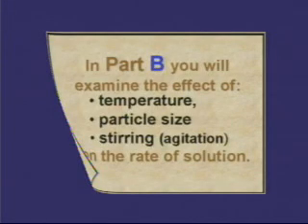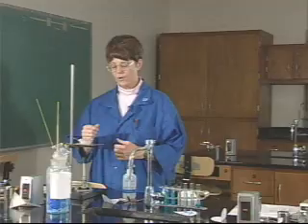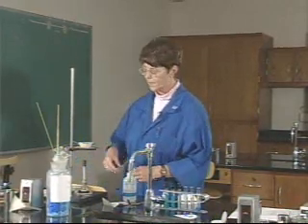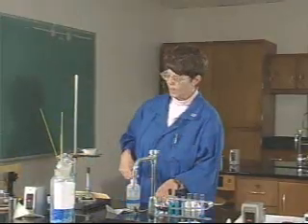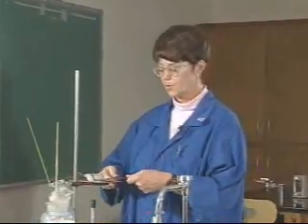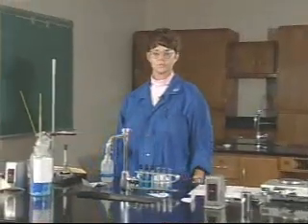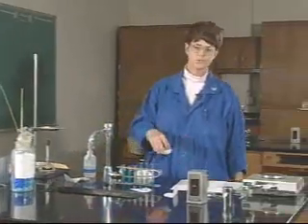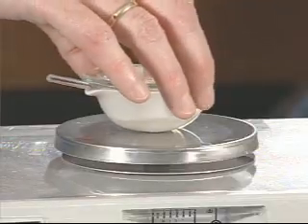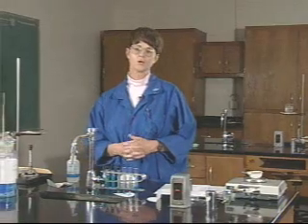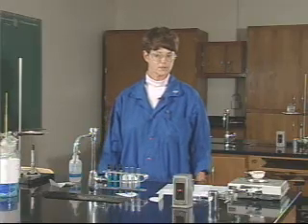After you've finished that set of tubes, Part B is complete and you can return to the work in Part A. We've had the evaporating dish on the wire gauze for a few minutes. The top of the watch glass looks dry — there's no more condensation on it — so we can turn off the Bunsen burner and allow the watch glass and the evaporating dish to cool. It can just stay on top of the wire gauze, or you can remove it to the hot pad. After the evaporating dish is completely cooled, you then can weigh the evaporating dish with the watch glass and the stirring rod. Remember to zero the balance first, place the entire assembly on the balance, and record the mass to three decimal places.